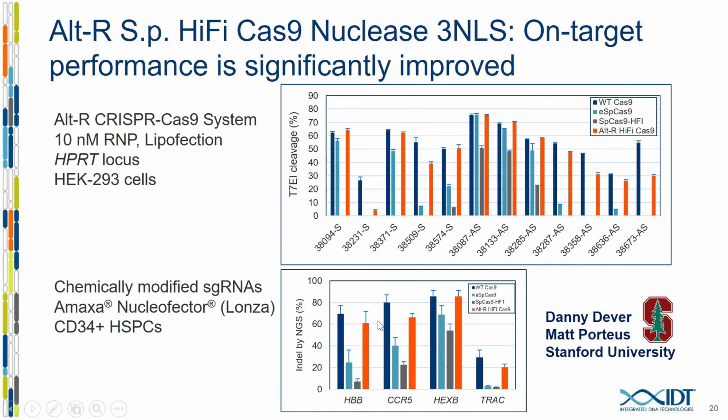The wild type and IDT HiFi work very, very similarly at most of these sites, where the other literature HiFis fail.